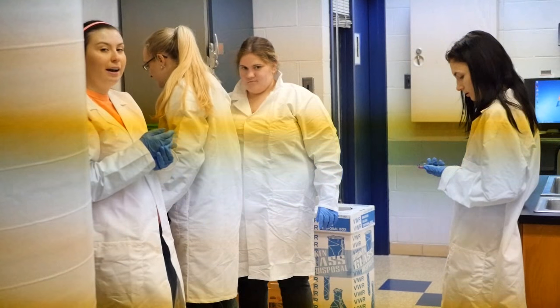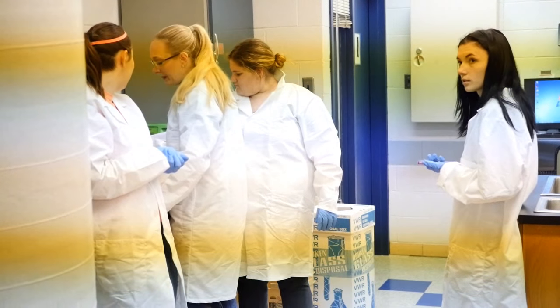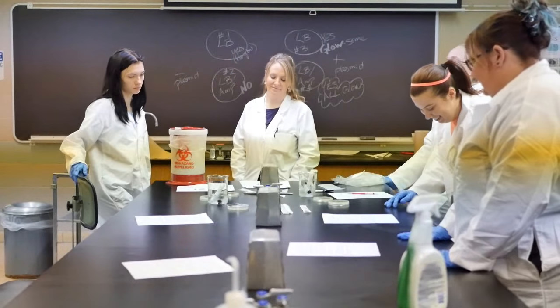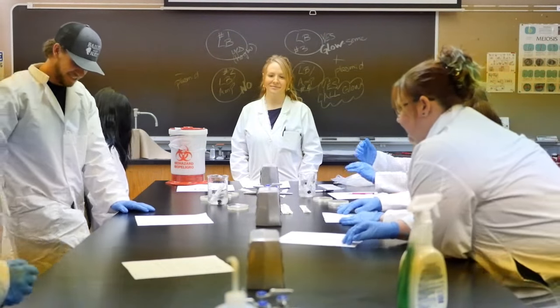Now, do we just bring that out at room temperature? Should I get up there? No, you stick it in. Okay. Get me nice and warm. Of course, if all people, that'd be me.